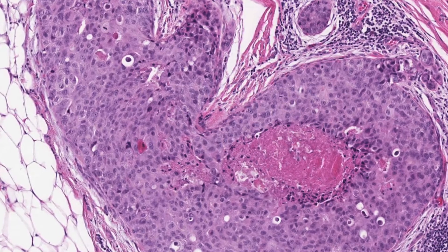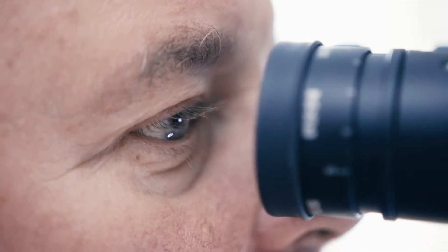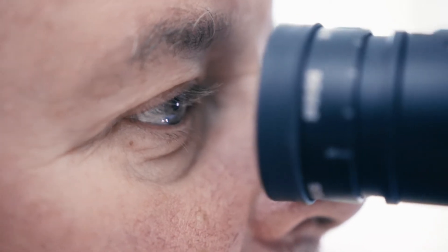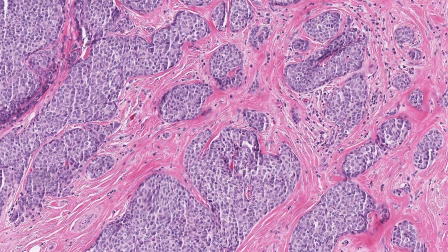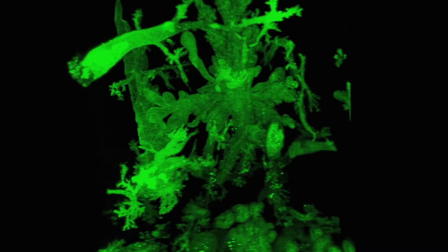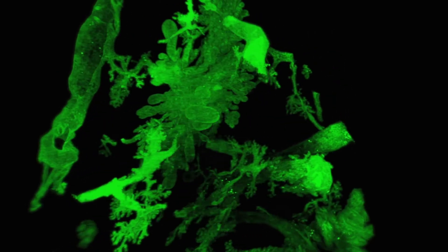This is how it normally looks when Fredrik Pontian and his colleagues are trying to understand breast cancer. But the images in 3D open up new possibilities.